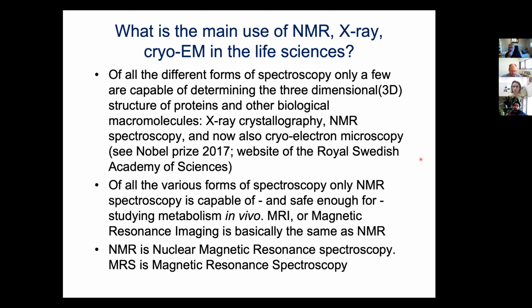I don't know if you've been introduced to cryo-electron microscopy yet in any of your courses. I hope some people have talked to you about it, because it's really the future of structural biology. It was recently, in 2017, awarded the Nobel Prize, and there is some really basic but very good information available on the website of the Royal Swedish Academy of Sciences where you can read up on this.